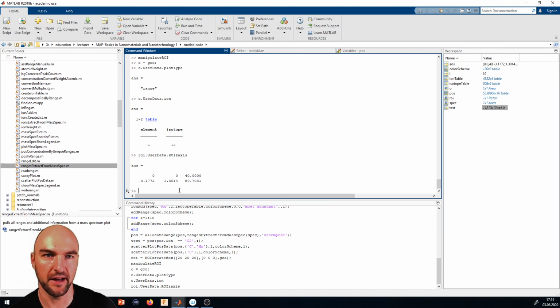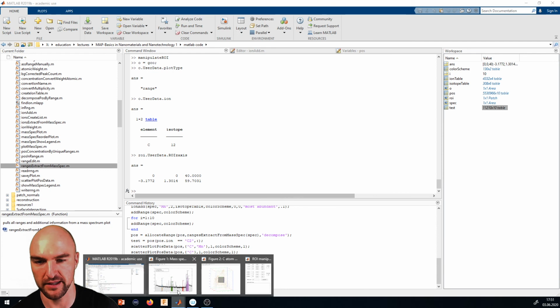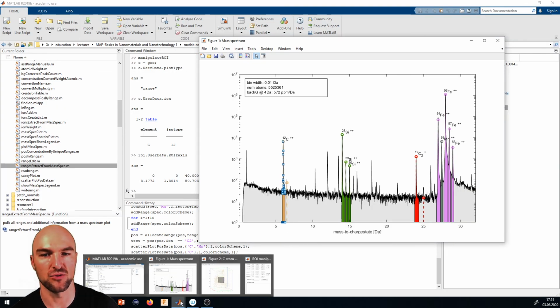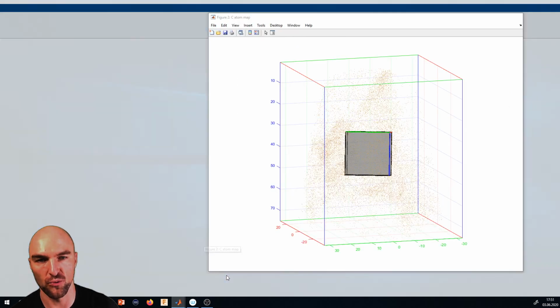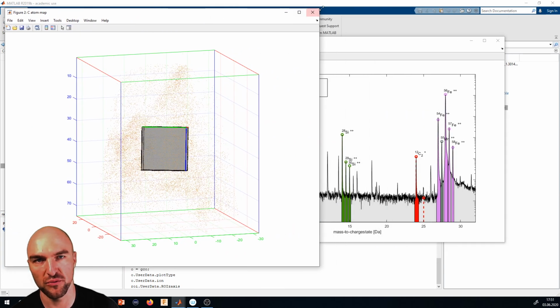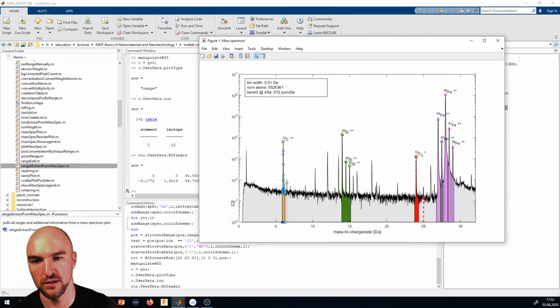Okay, so this is actually the basics. You can try that out already if you go into Atom Probe code. And in about 2 weeks, we'll have everything consolidated and migrated, and then we can give you a full rundown on the entire power of the analysis system. So I think it's gotten really slick, and it's most of all gotten really powerful in terms of getting you from your data to something publishable really fast, because everything is a vector graphic, everything can be scripted, and everything can be repeated for a lot of data sets very, very quickly.